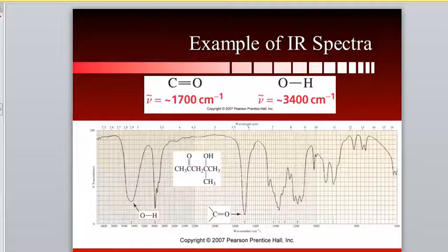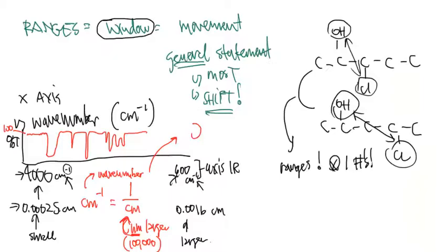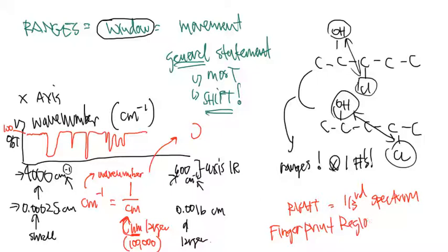There's a part of the spectrum, though, that I really don't concern myself with. There is a point here where too much becomes too much. And this is the right-hand side, about the third of the right-hand side of the spectrum. This is what we call the fingerprint region. And the fingerprint region is an area that is very specific to each molecule.